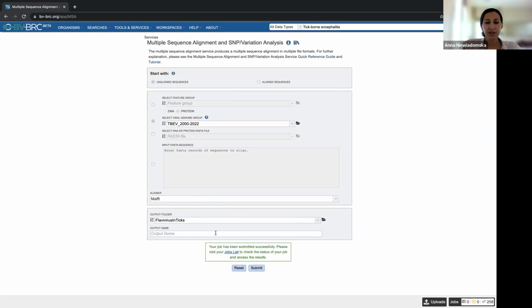If everything is okay, it should tell you that your job has been submitted successfully and that you should check the job list to find out when your job is done. You might think, okay, how do I find out where my job is now? If you're not familiar with this site, there's a couple places you can go to do that. You can click on workspaces and click on my jobs. Or if you've been paying attention, you'll see this little box down here, and you'll notice that it changed as soon as I clicked the button.